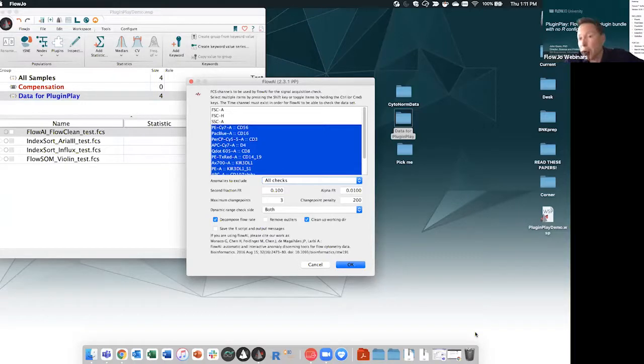If you'd like to grab another plugin that's not yet bundled into plug and play that has an R requirement, there are a step or two, such as copy and paste to load the R library needed. Copy and paste the command that does that into R, hit enter and go, but no R needed beyond that. So our goal is to move away from you needing to know any R, and we've minimized it pretty well so far with these.